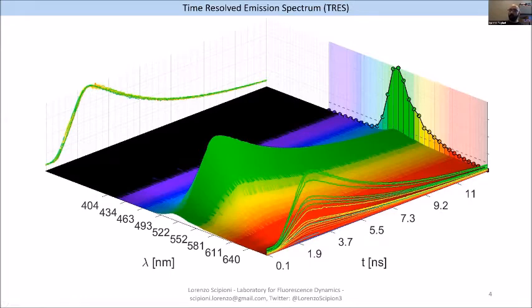So now each one of our images is, let's say, 256 by 256 by 32. Now, this poses a problem because for every image, we're actually collecting almost 7,200 images, right? So it's a lot of data.